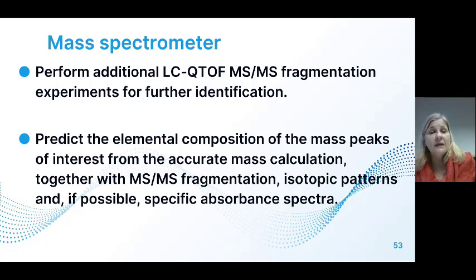Now, after you have done your separation and you have your compounds, in many cases, we would put it through another MS so that we can get a fragmentation, because in the first step you have a soft ionization, which would just give you basically your mass peak.